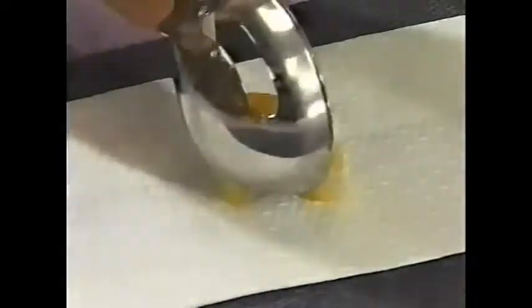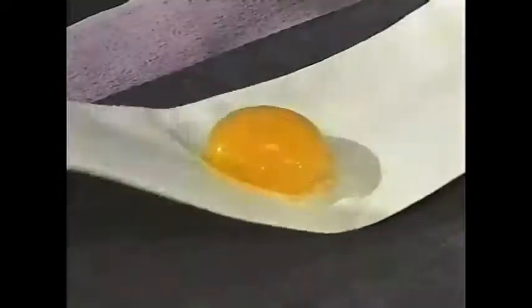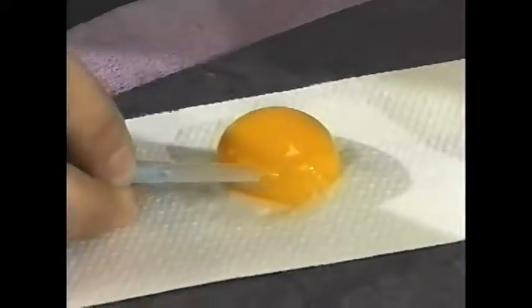Now we are placing that yolk, with the albumin removed, on an industrial-type paper towel, and we'll gently roll it on that paper towel as you see here until we find that germinal disc. What we're trying to do is get the albumin off of that germinal disc area — we can either roll it across the paper towel or gently dab that area over the germinal disc.